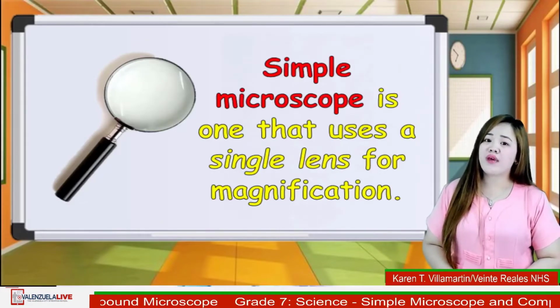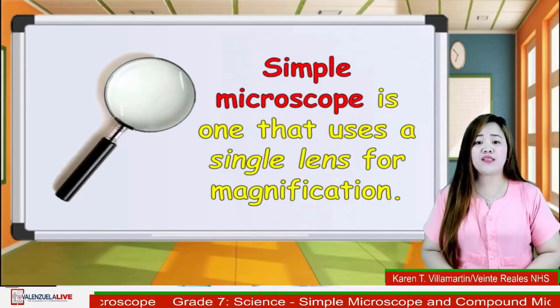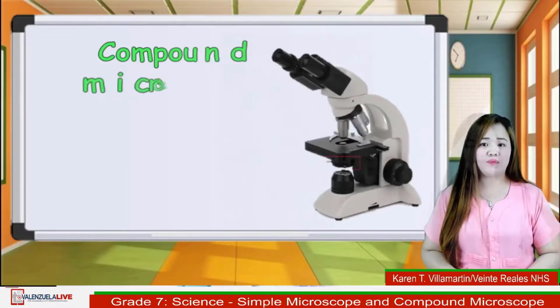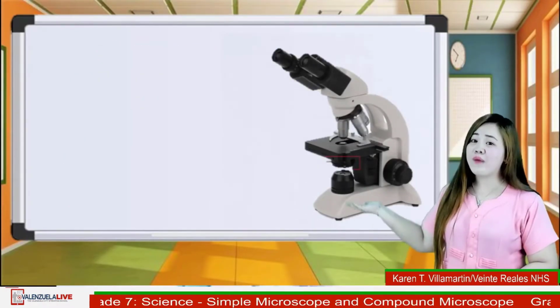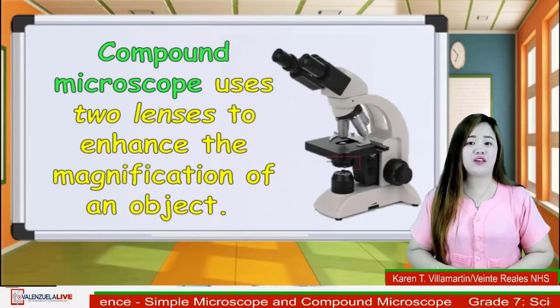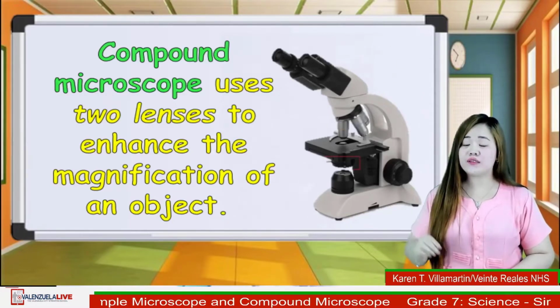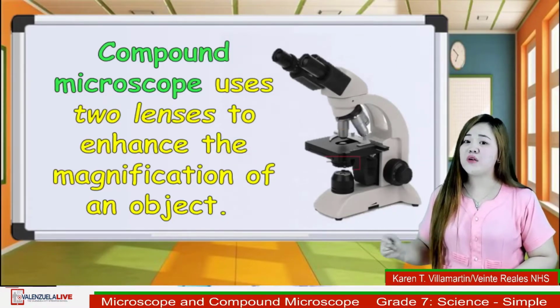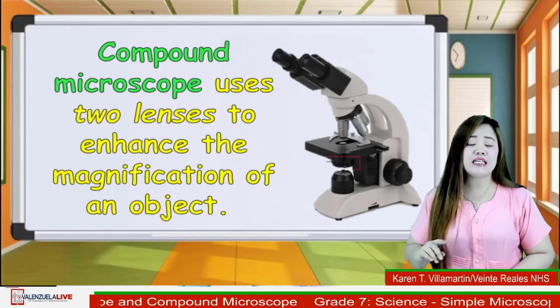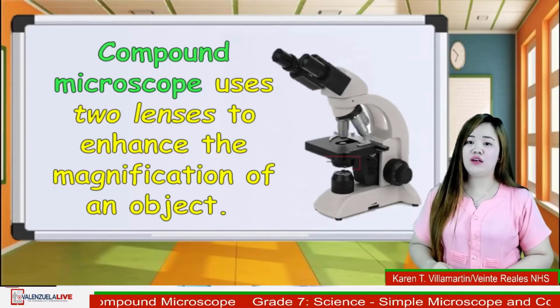Today, simple microscopes are not used often because the introduction of a second lens led to the more powerful compound microscope. The compound microscope offers better magnification than a simple microscope. The second lens magnifies the image of the first. Compound microscopes are bright field microscopes, meaning that the specimen is lit from underneath, and they can be binocular or monocular.